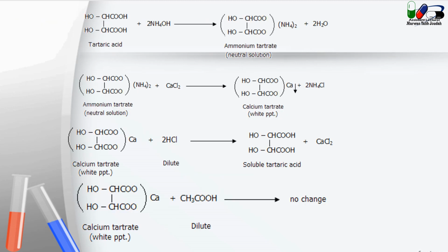This is the general reaction: tartaric acid with ammonium hydroxide. This is just how to make it a neutral solution, and we have had this in one of the slides previously.